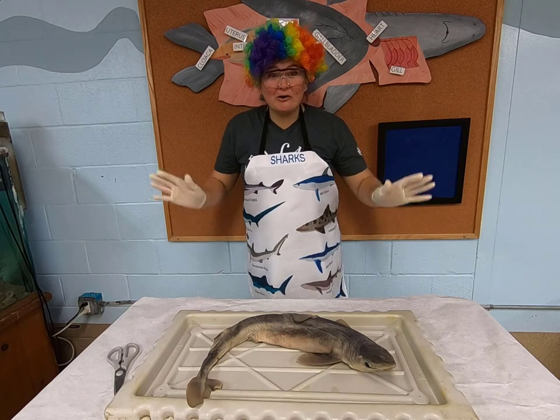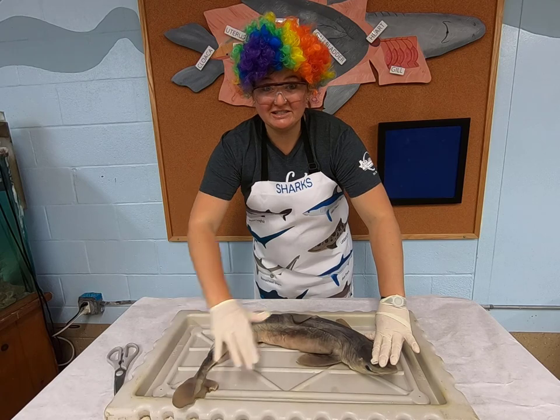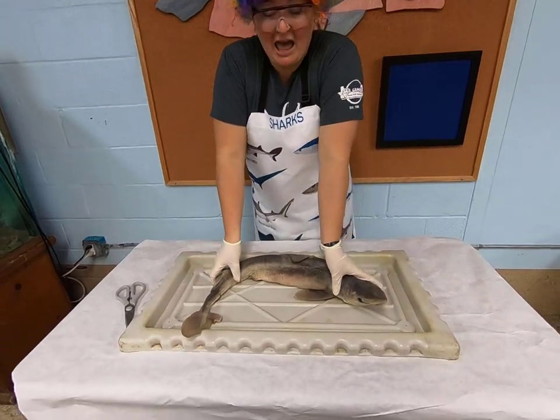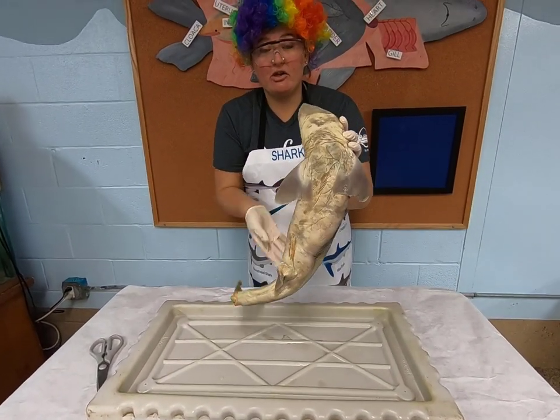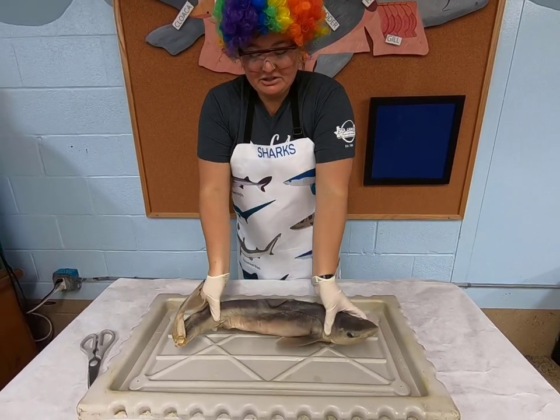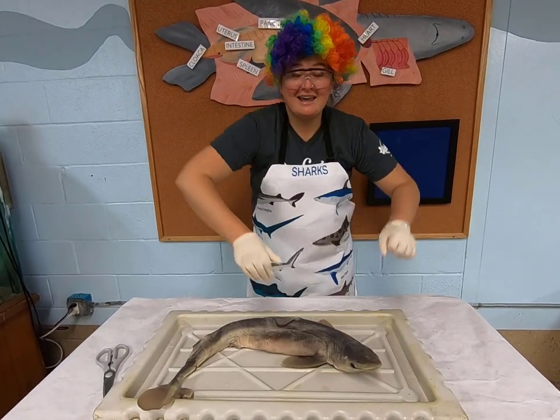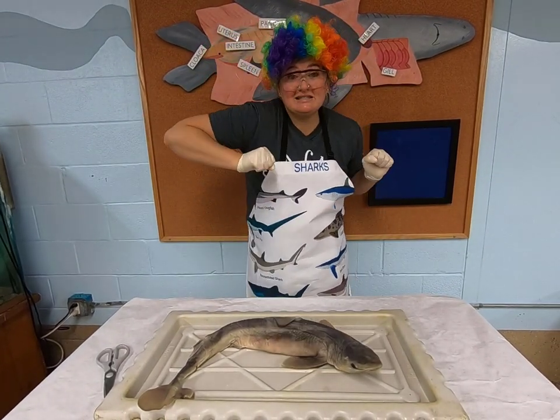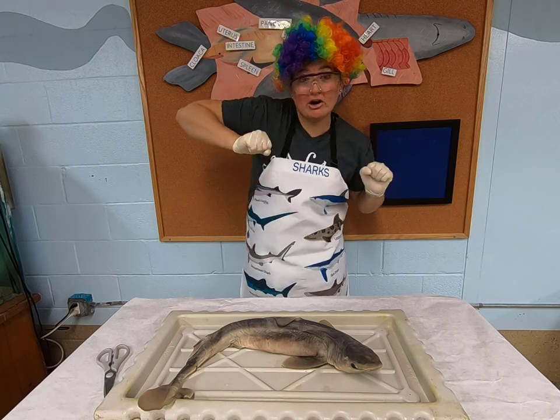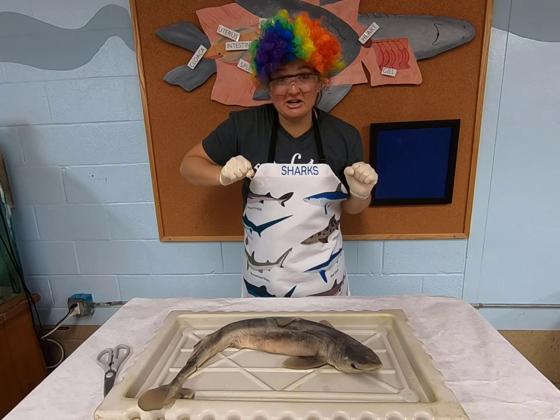Over the external anatomy, all right? So we have our dorsal side of the shark, which is the top side of the shark, and we have our ventral side of the shark, which is the bottom half of the shark, the lower part of the shark. So our fins, we have two pectoral fins, and they have these pectoral fins so they can swim and balance themselves in the water and also help them steer. So these fins help them be able to steer.